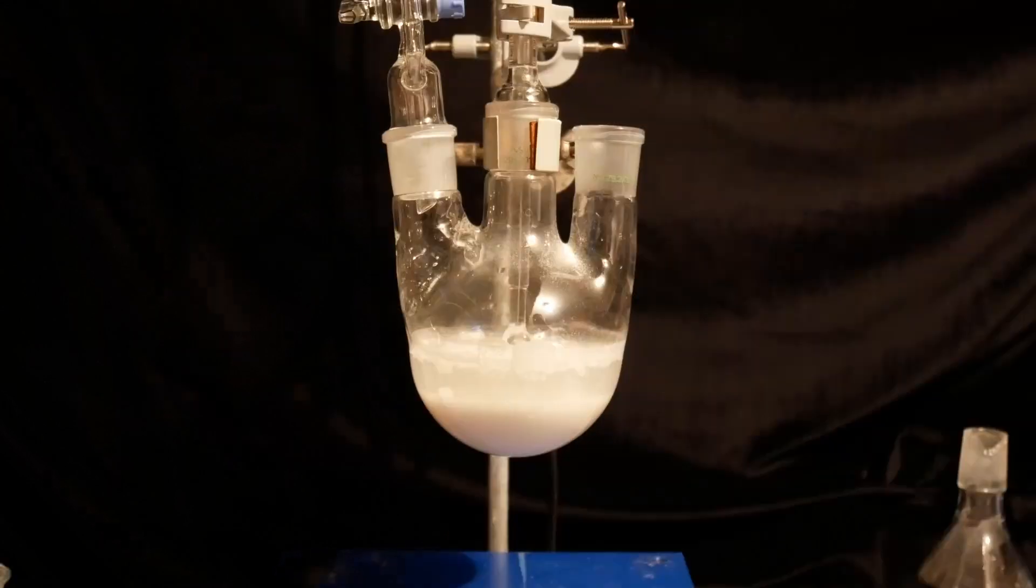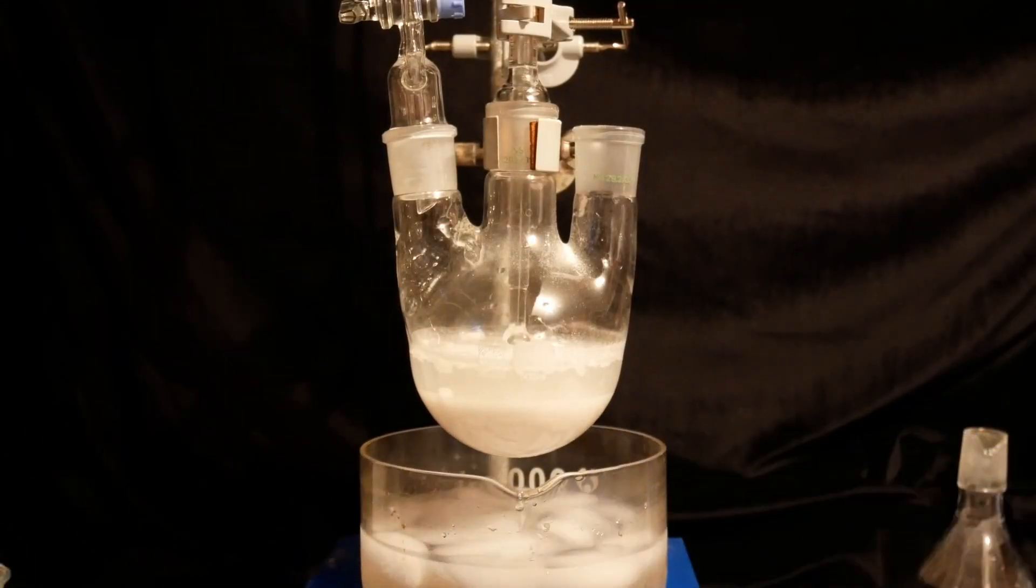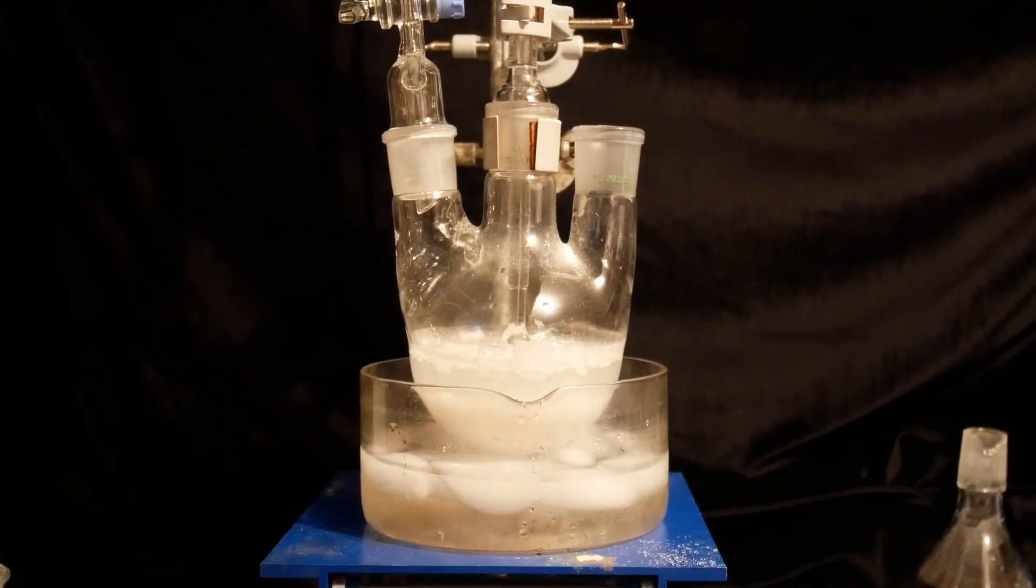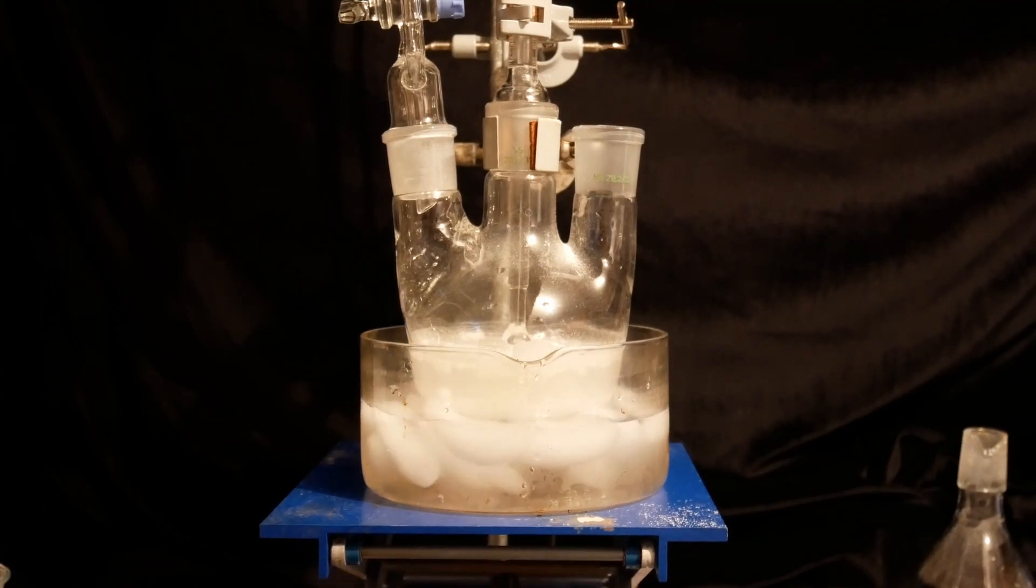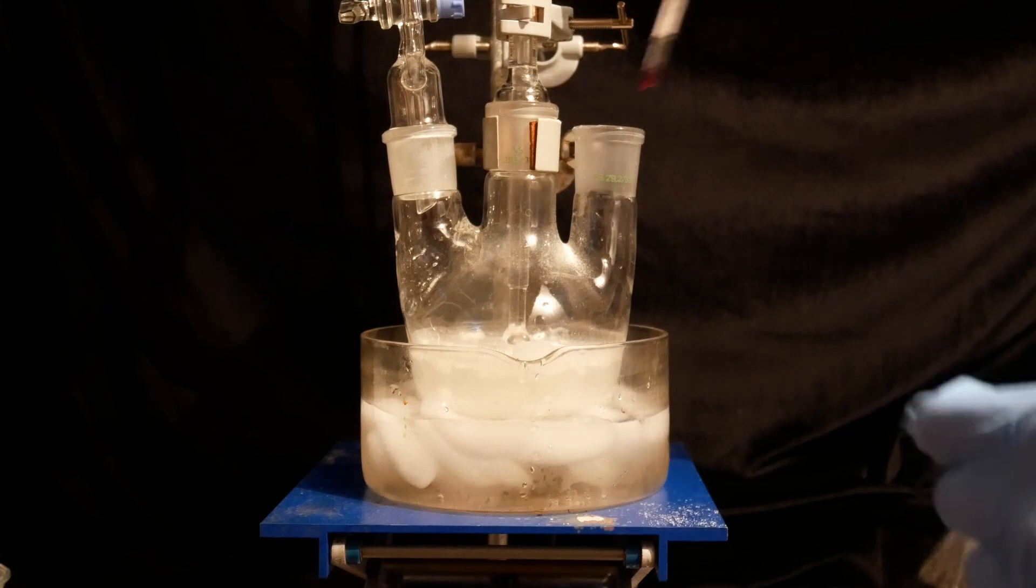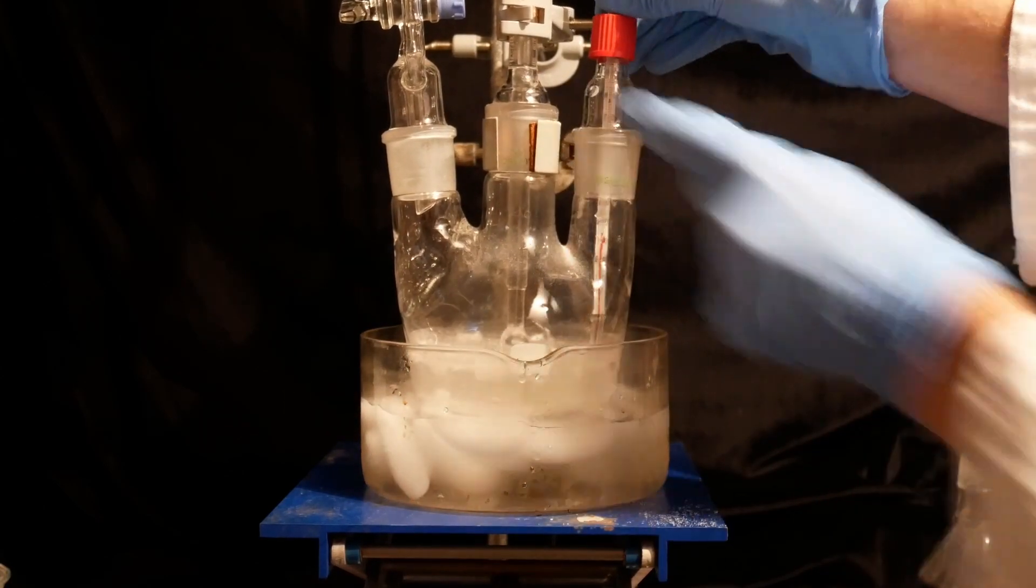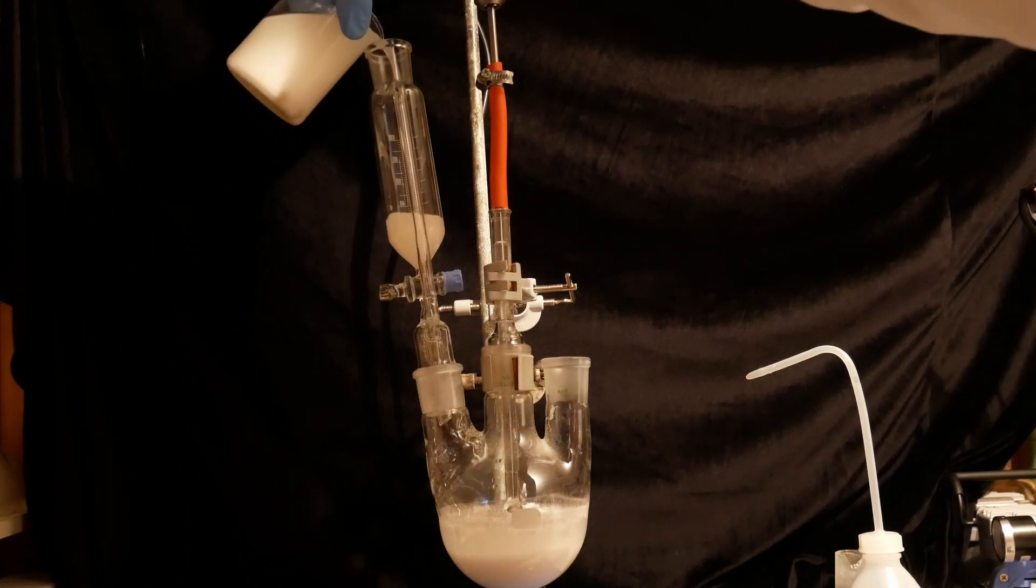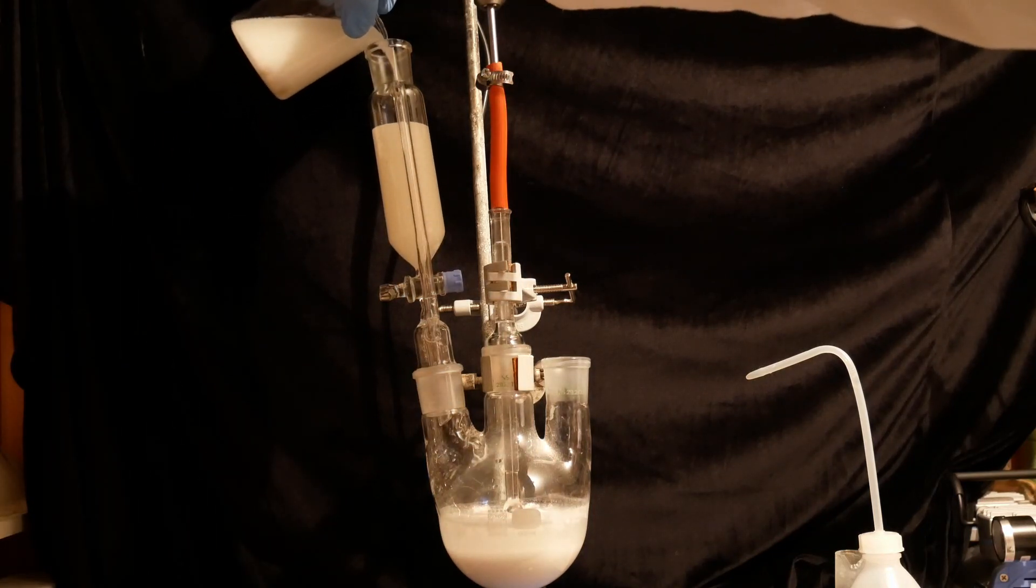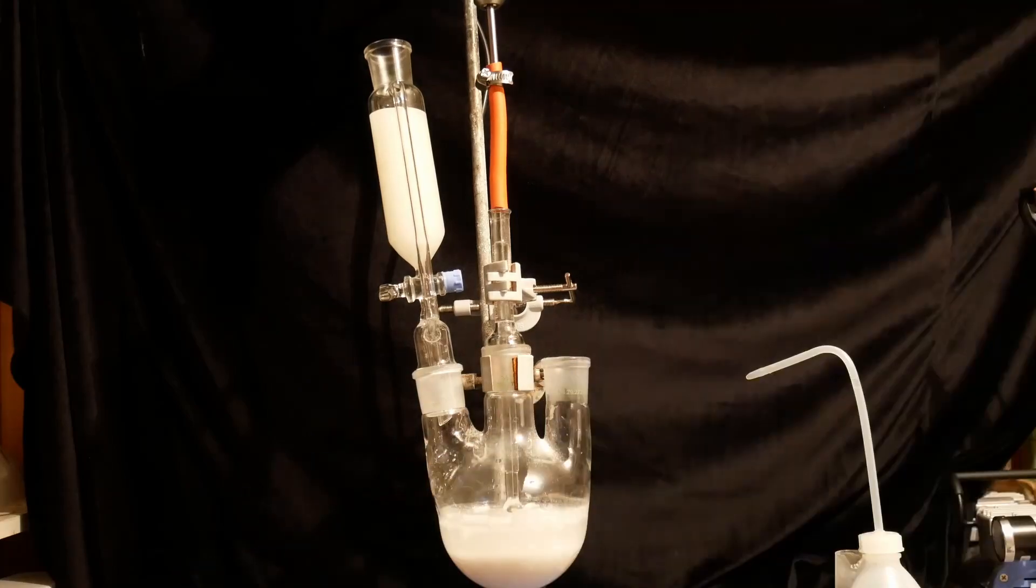An ice bath is placed below the flask, as the addition of the hypochlorite is quite exothermic. The reaction temperature should be maintained between 0 and 10 degrees Celsius for this step. The hypochlorite solution is placed in an addition funnel above the flask, and with medium stirring, the hypochlorite is added into the reaction mixture.